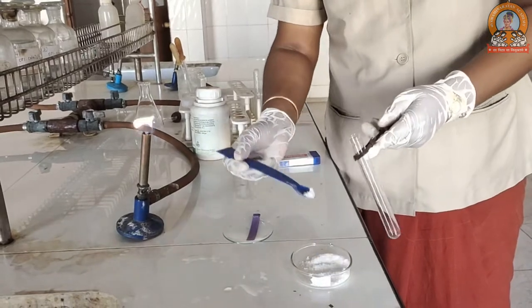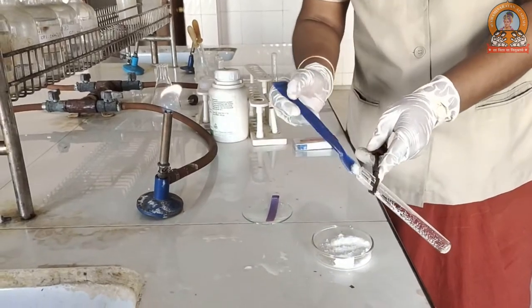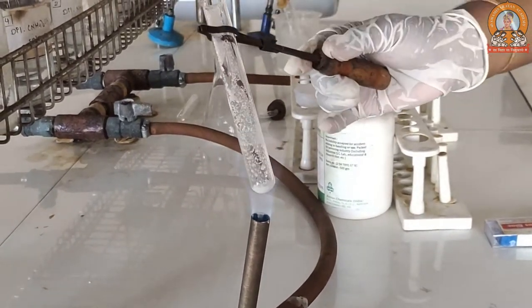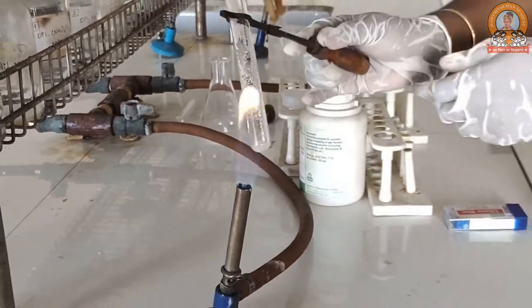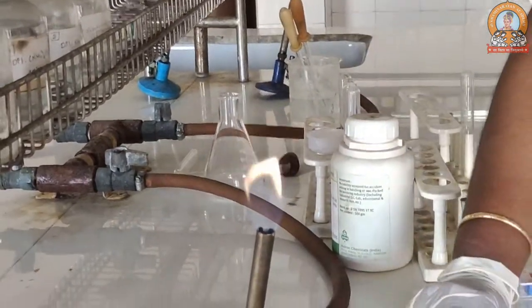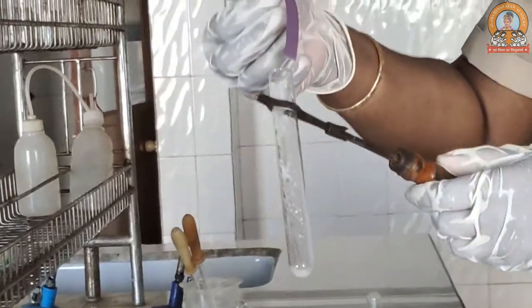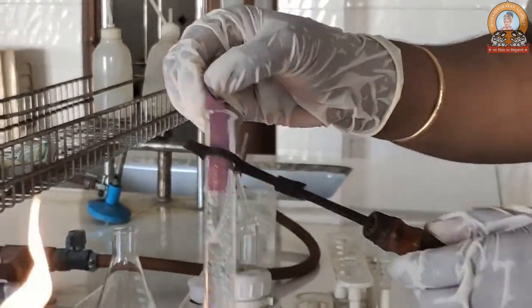Now the dry heating test. We will take a slight amount of salt in a dry test tube and we will heat it up. While heating, please take care that your test tube should not be in much contact with the flame, otherwise there is a chance of explosion. While heating, you can bring the moist litmus paper over the mouth of the test tube, and if it turns red, that shows the presence of acid.